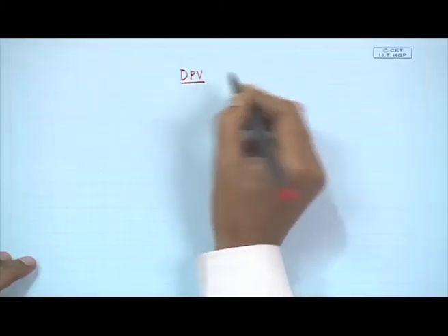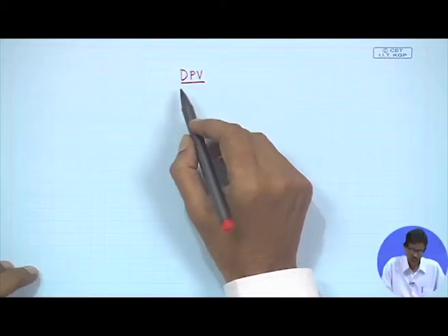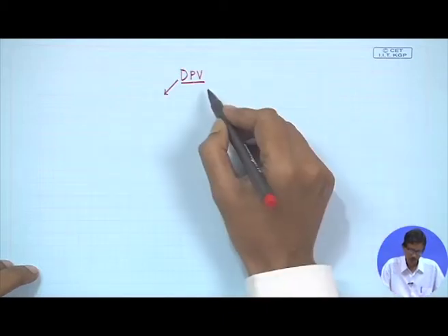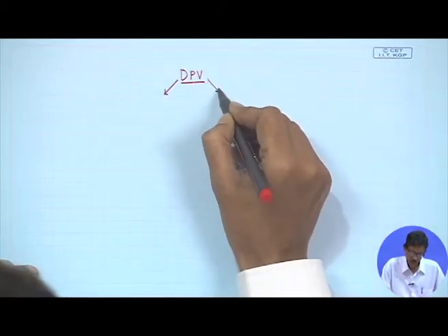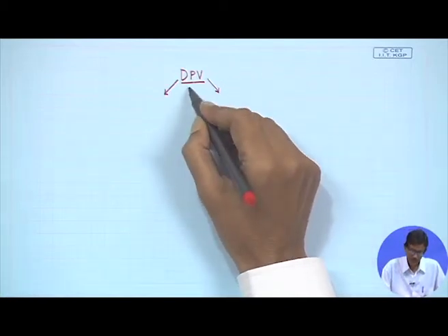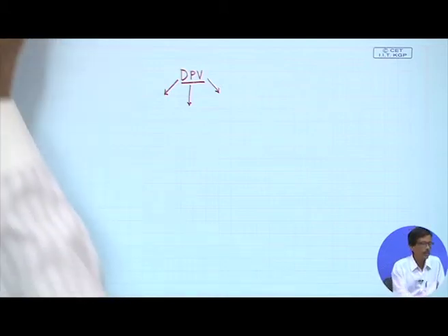Hello and welcome back to this class where we are talking about the differential technique, the DPV, and as we have discussed, we can have different types of electrode modifications that we will discuss just now. Before that, we can have the development from the electronics part to generate the pulses, and the computers to record those pulses as well as to deliver those pulses to the electrodes.